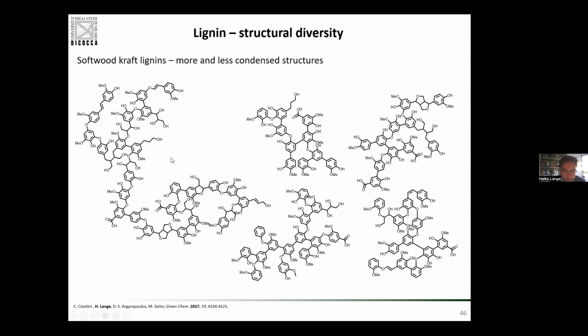And then in kraft lignin, the interesting thing at the end of the day was that probably it is not very homogeneous in terms of the size and in the molecular type that we have in there. We might have at least two fractions, one fraction of smaller molecules, more condensed, one fraction of larger molecules, less condensed. And normally from a reactivity point of view, you can imagine that this is chemically not the same as this, right? We have the same atoms, we have the same functional groups, but in a completely different correlation. So this is something else than this. In a lignin without fractionation, it comes together, I get an overall picture, but the overall picture doesn't help me if I want to devise the perfect valorization, actually.